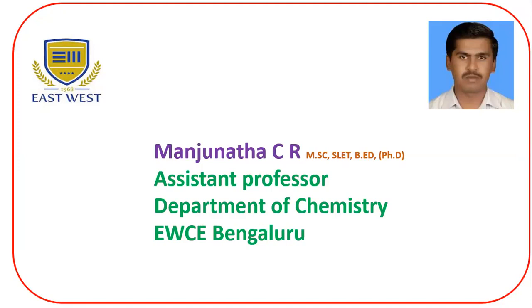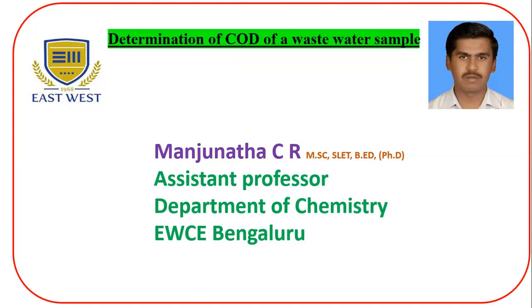To show the extent of pollution present in water, we can determine it by one experiment called chemical oxygen demand, nothing but the COD experiment. Today, I am going to teach you this concept, that is, determination of COD of a wastewater sample.